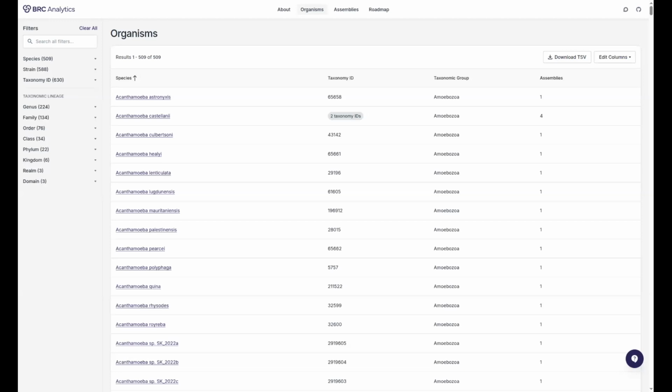Of course, you may ask, why don't we just keep the latest version? Well, latest versions sometimes are more complete than the previous versions, but they usually contain less annotation, because ultimately when genome versions change, you can view a genome as a coordinate system. So once they change, your coordinates change. And so it's not that straightforward to actually lift a set of coordinates corresponding to, say, genes from one assembly to another assembly. So this is why usually we have multiple assemblies per species.